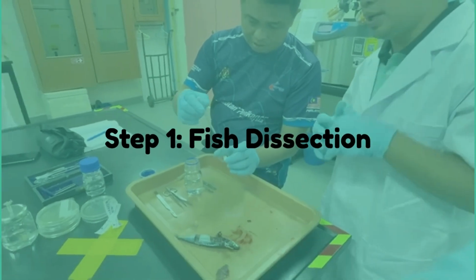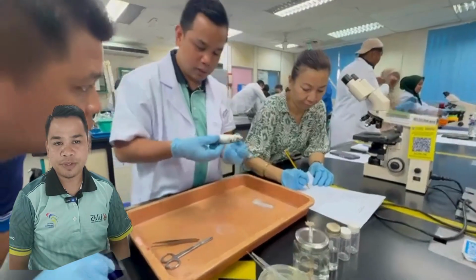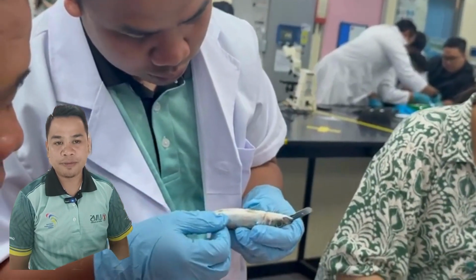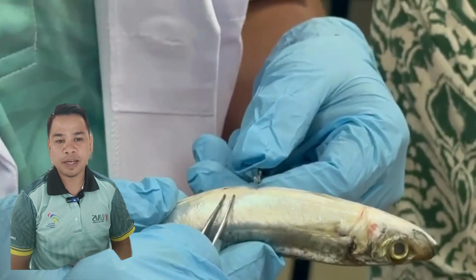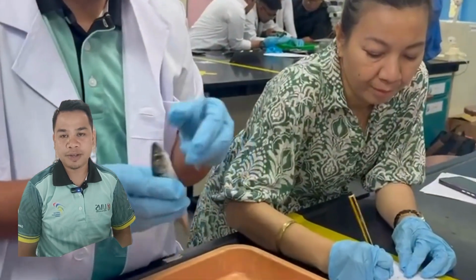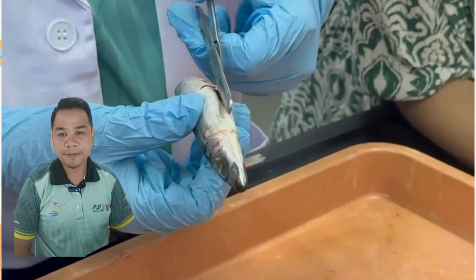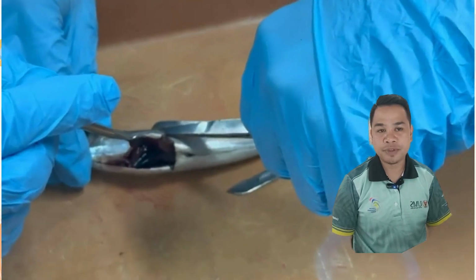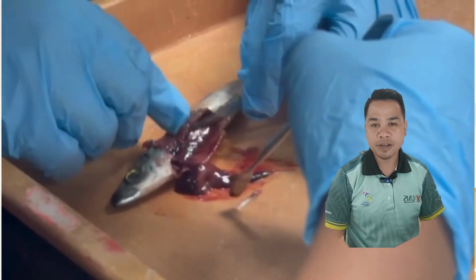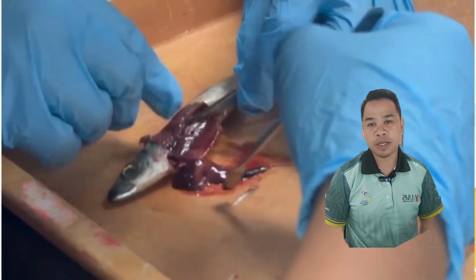Step 1. Fish dissections. Put the fish on the dissecting tray and observe the external features of the fish such as head, caudal fin, dorsal fin, pectoral fin, eye, anus, and skin. After observing, all the external features of the fish are normal. Next, the fish was dissected: liver, spleen, intestine, kidney, and brain. After observing, all the internal organs of the fish are in normal condition.